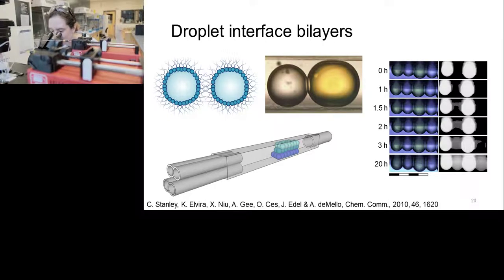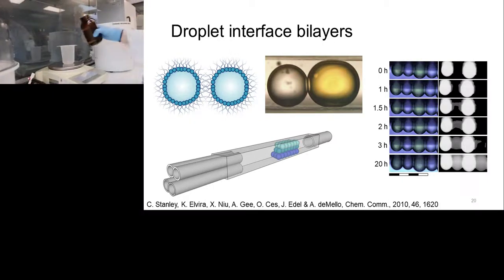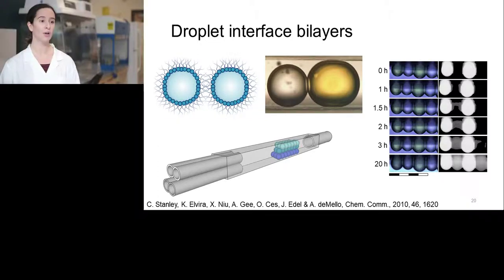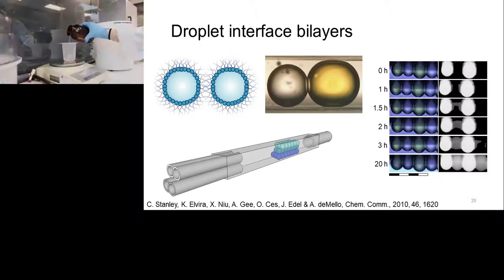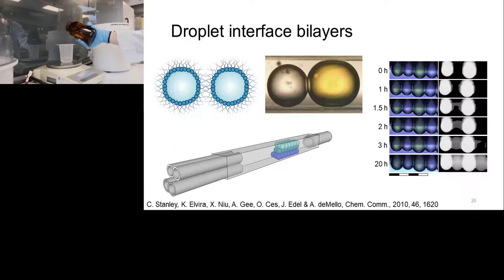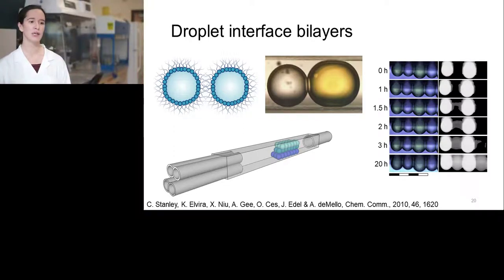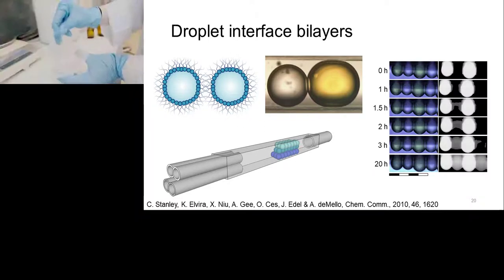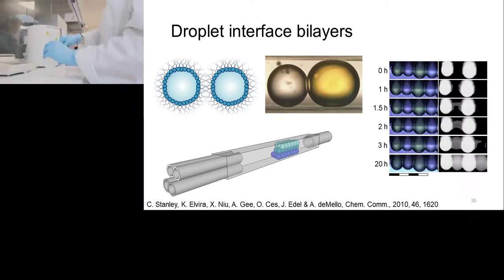What I'm really interested in investigating with our artificial cells on a chip is being able to predict how a new drug behaves in the human body before we put it into human beings. It takes around 10 to 15 years and around $2.6 billion to develop a new drug. And a surprising amount of new drugs fail when we try and test them in humans.